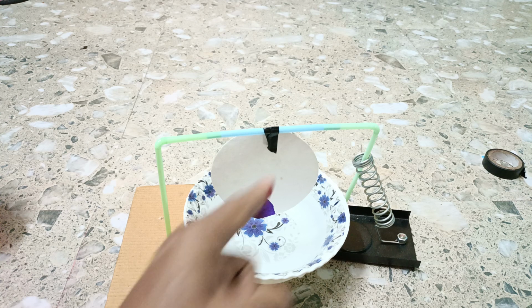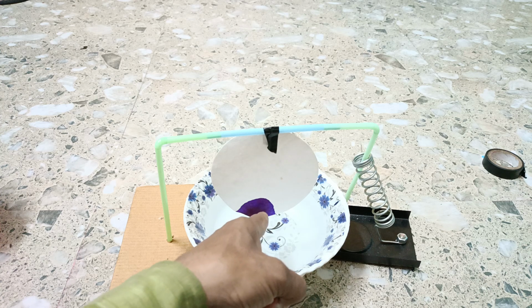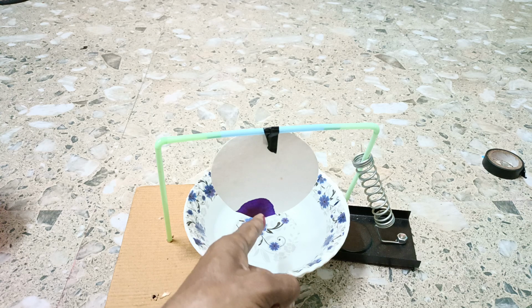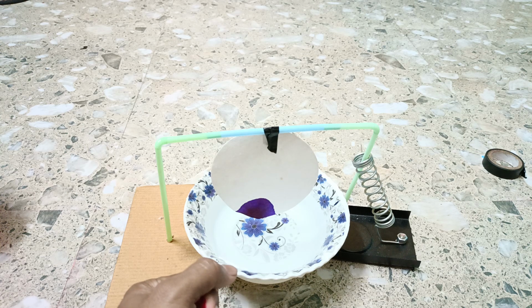You see here we have taken a filter paper and you can see there are two colors of ink, one is blue and the other one is red. And here in this bowl we have taken water. You can see how chromatography works.